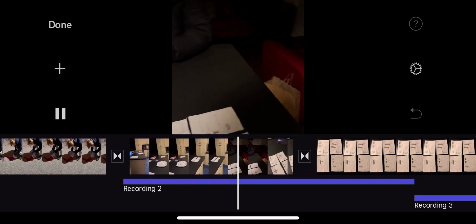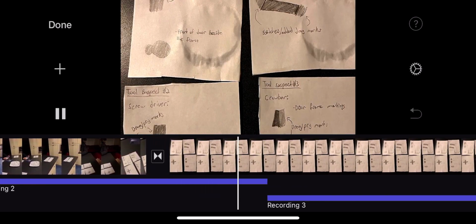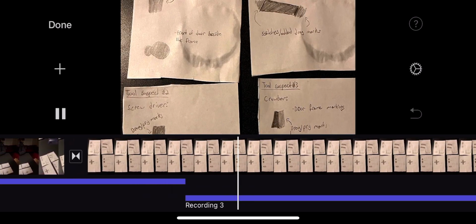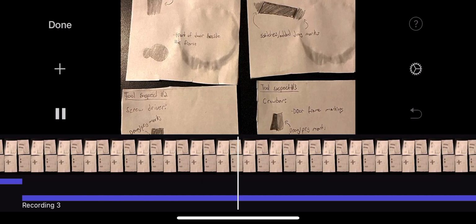As we return back to the lab, the dream team individually focuses on their specialties. First, we begin with tool marking. So, the analysis of tool marking. The first thing we're looking at is the crime scene.